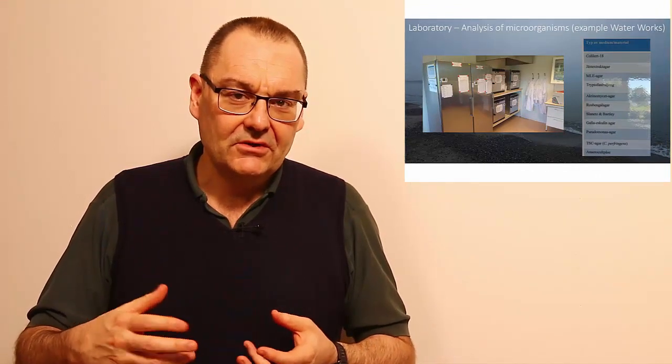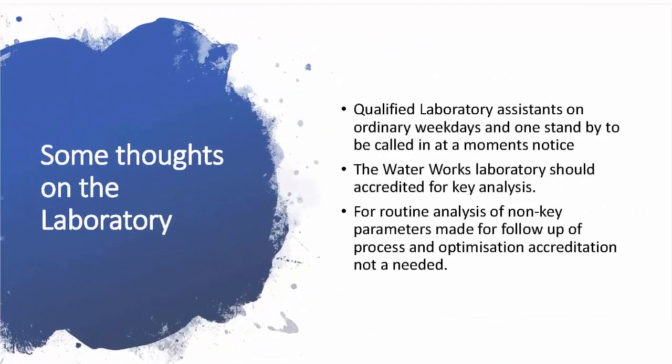With that said, let's go to the next slide and some summary in regards to the quality of the lab I would say we need in our case. When we now are in the business of using treated wastewater for drinking water production, these are some thoughts on the labs, and I see the lab as crucial for the quality control and overall process optimization. So let's have a look at the bullet points I made here.